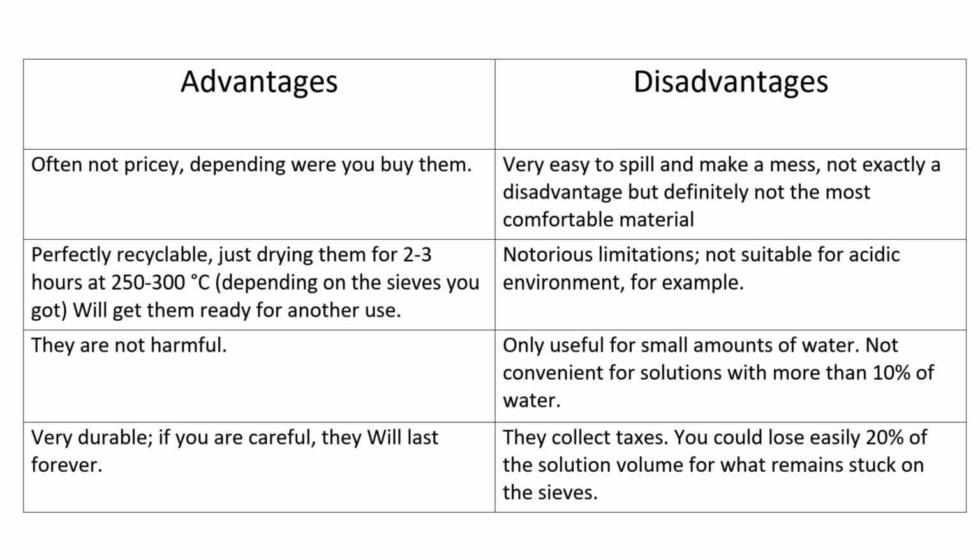In this table I listed the most important advantages and disadvantages of using molecular sieves for drying.